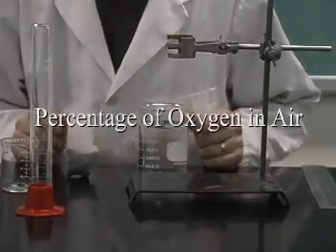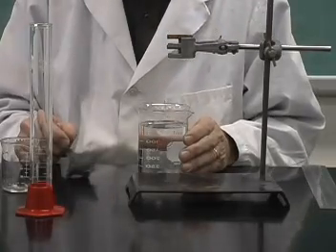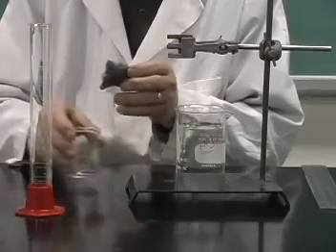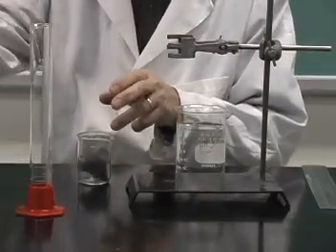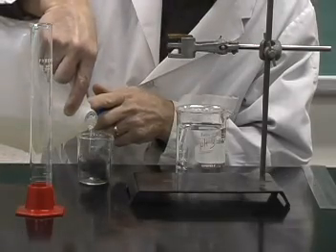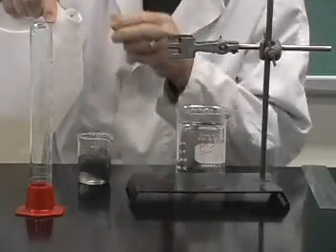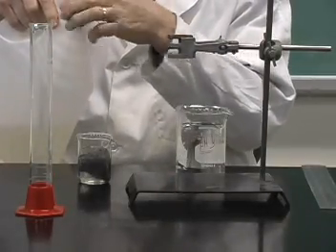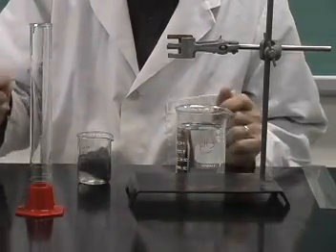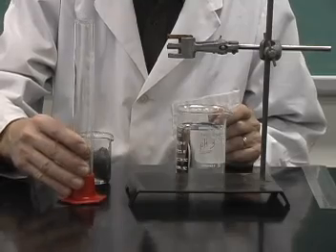We'll now do a demonstration to show how we can calculate the amount of oxygen in air. I have some steel wool, and I'm going to put the steel wool in a solution of acetic acid in water, commonly known as vinegar. And that's just to let the steel wool become a little bit more reactive. We'll let that sit for a few minutes, and then we will put the steel wool in a graduated cylinder.